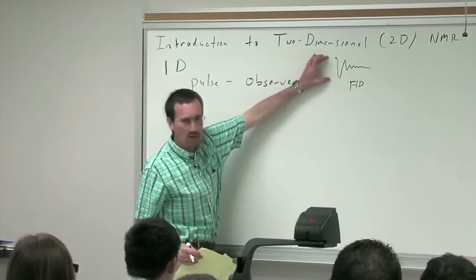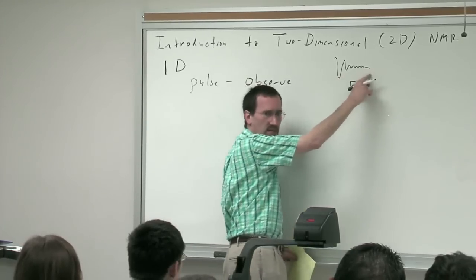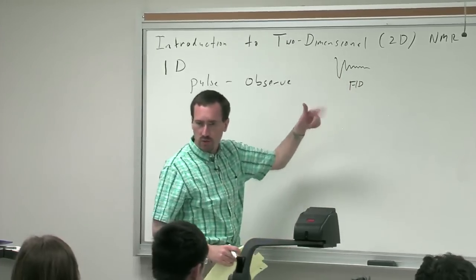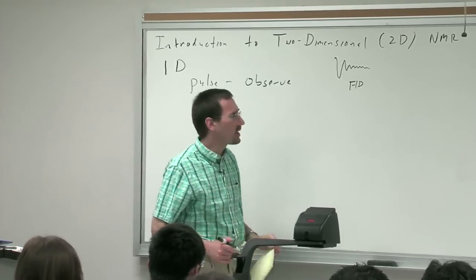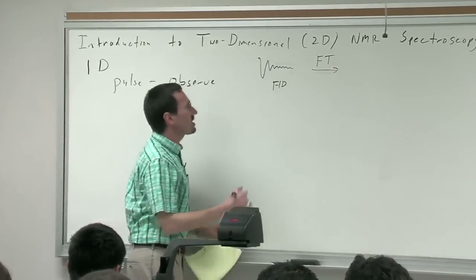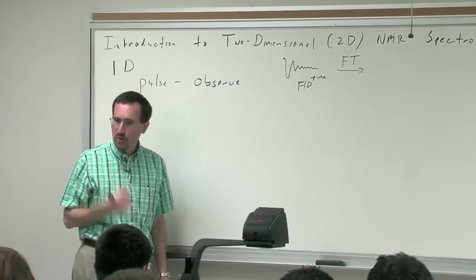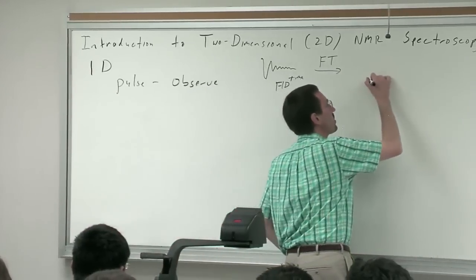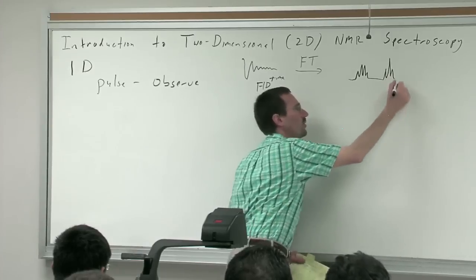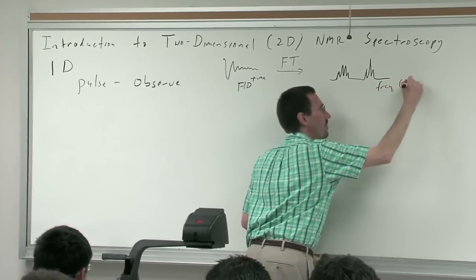And of course, what you've got here is an amplitude domain, and then over here, you have time. This is literally your signal dying off with time, and the cosine wave corresponds to the periodicity of the various nuclei. The whole idea in a 1D Fourier transform is that this time domain on the x-axis gets transformed to a frequency domain, and that's your parts per million.